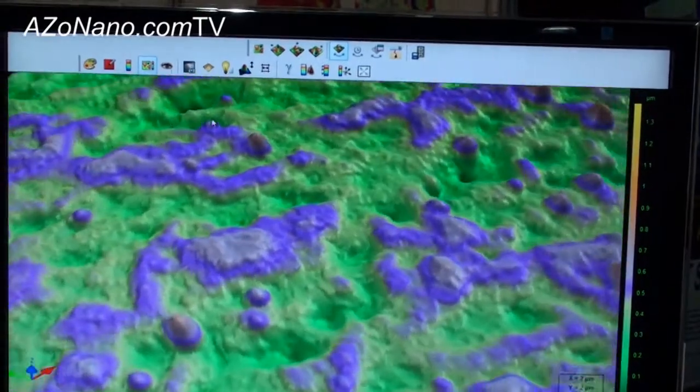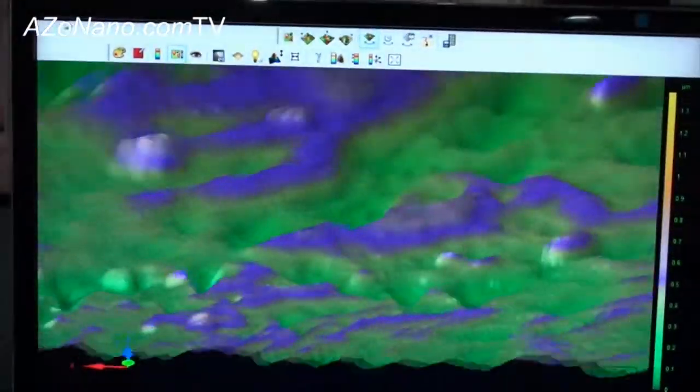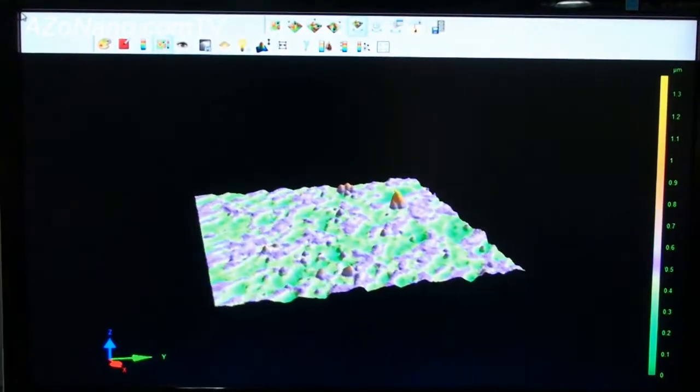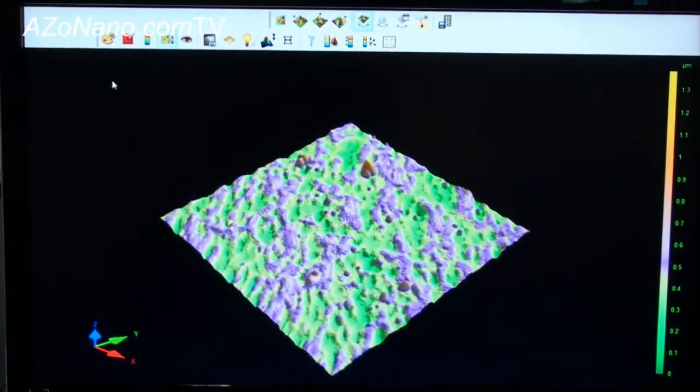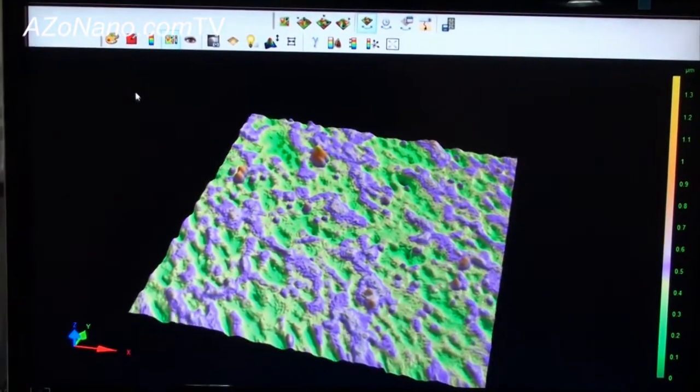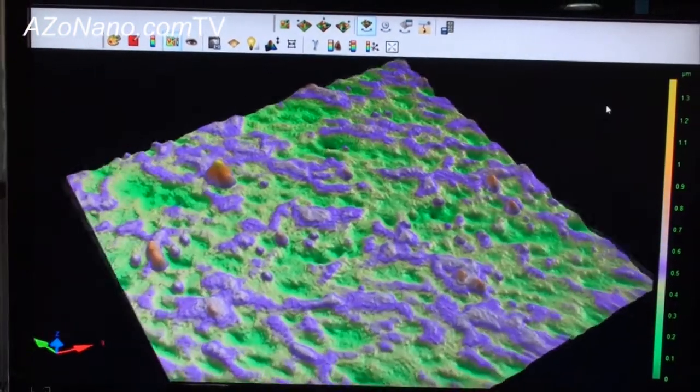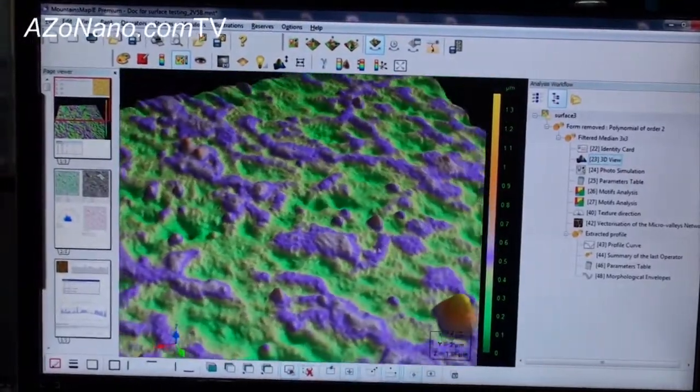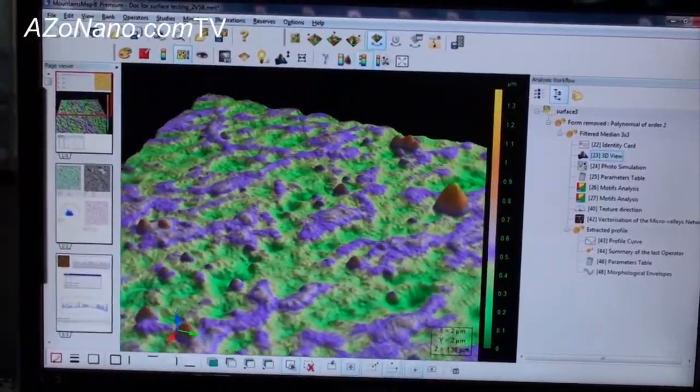As you can see here, there is a surface in 3D. It's a polymer with gold deposition on the top and one of the benefits of the mountain technology is to visualize your surface. So here is a surface of about one micron height with an animation of the rotation.